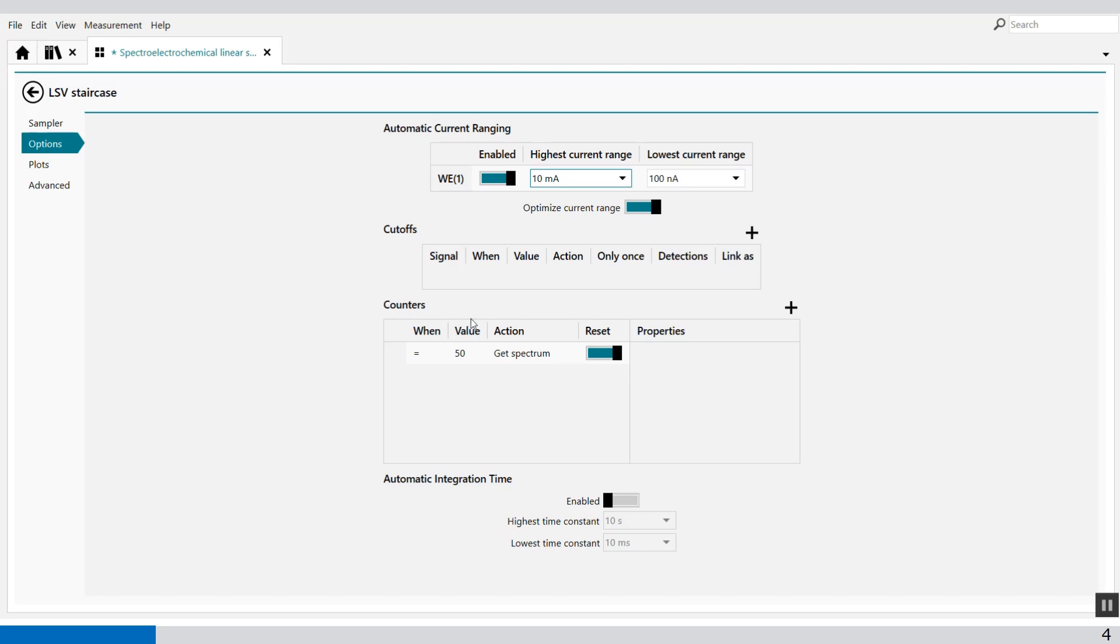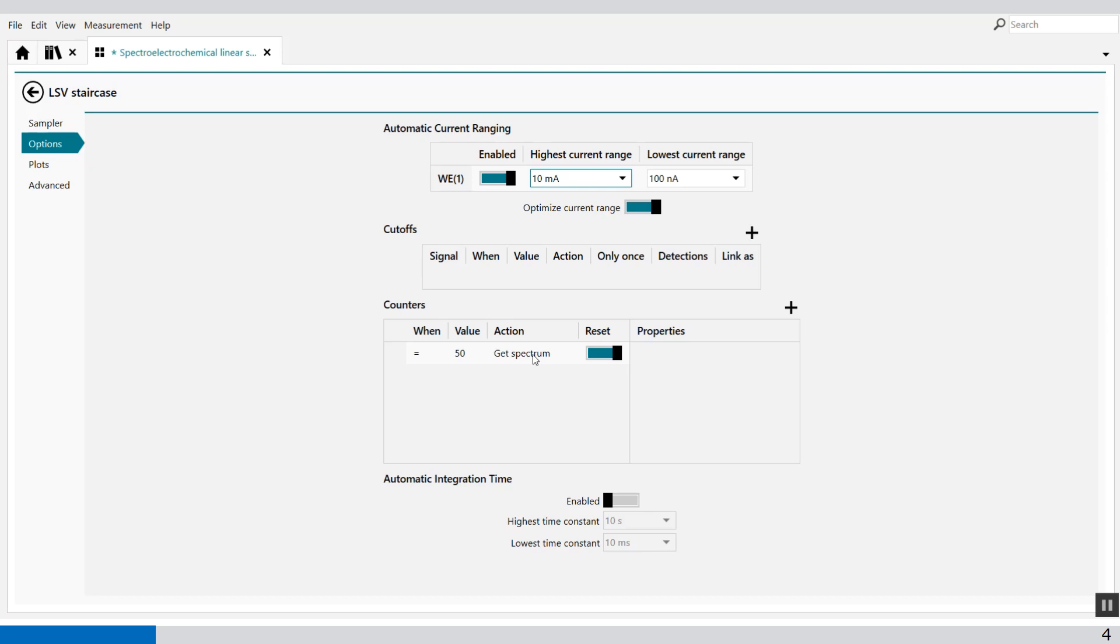The counters, this is actually important. Here you define at what time you're going to take the spectrum. So the counters can be used during a measurement to perform dedicated actions whenever a condition associated with the counter is triggered. Each counter accumulates during a measurement and it is possible to assign a specific instrumental action when a counter reaches a user defined value.